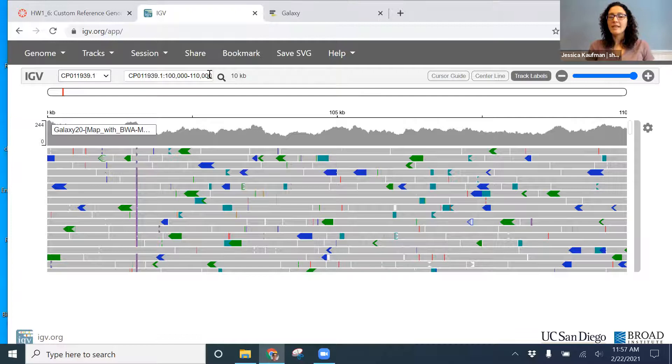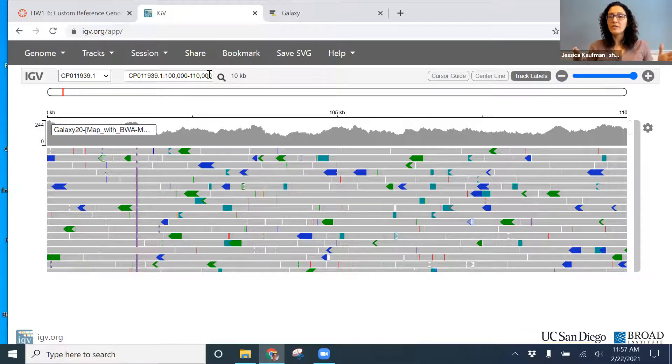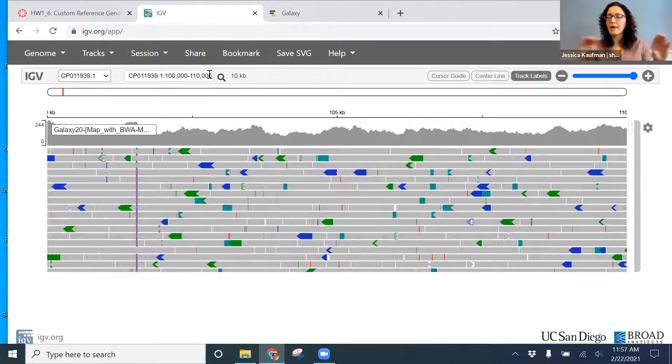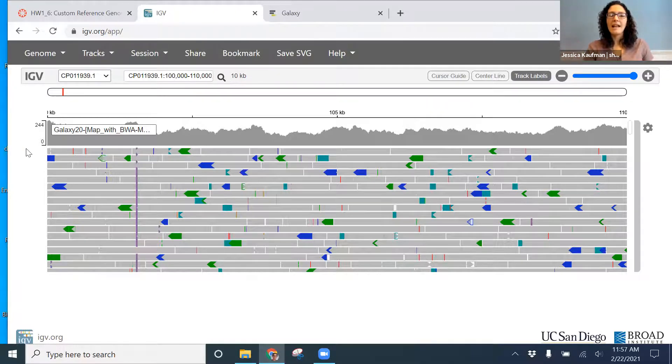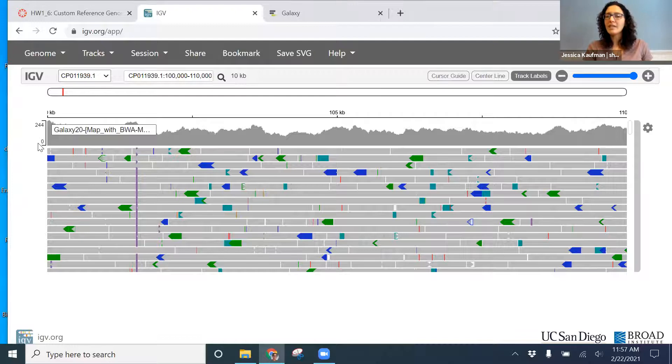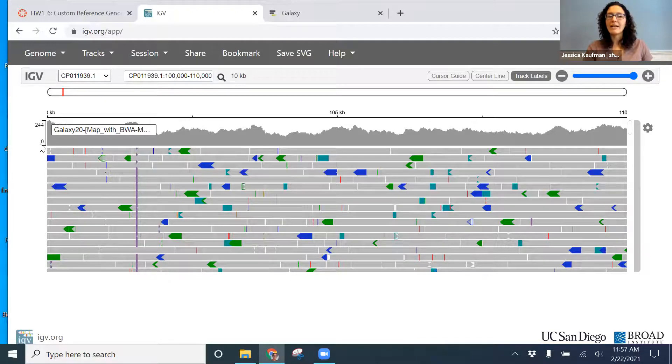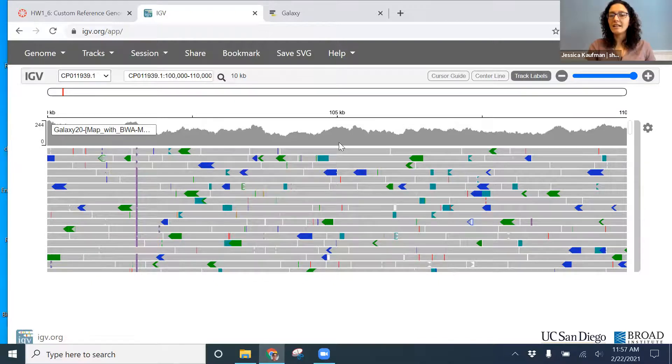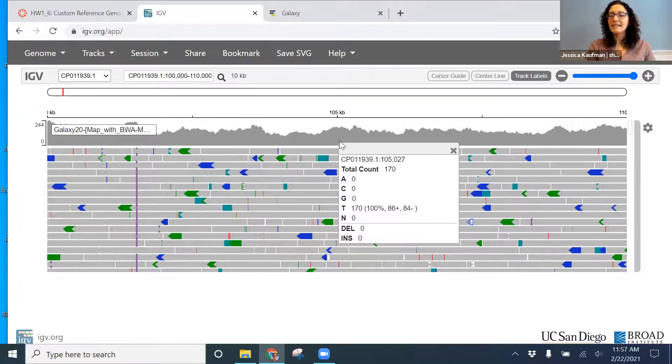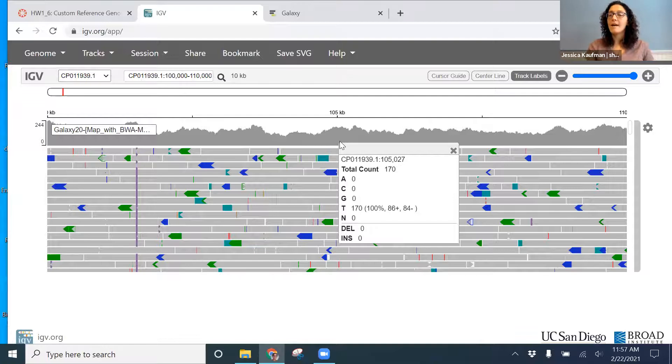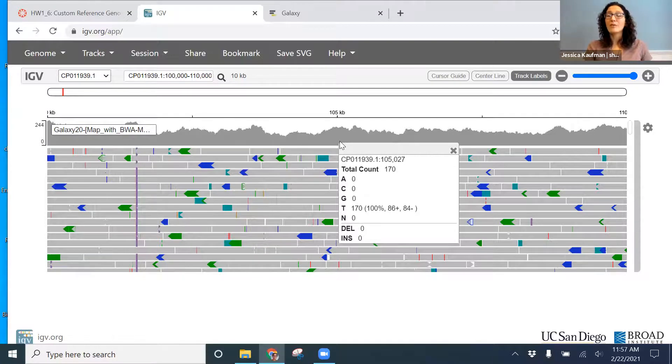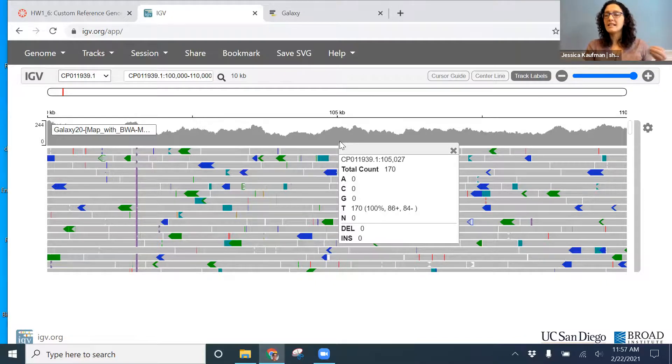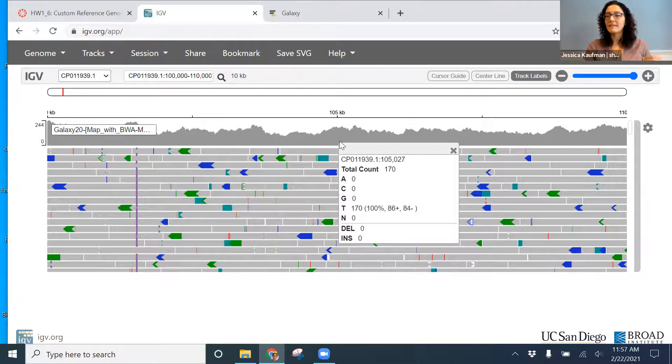So on this portion of the genome, I can see that every base pretty much got read. There's a gray histogram over every base in this region, and the number of times it got read varied anywhere from 0 to 244. I could click on an individual base and see that at this position, the genome was read 170 times. So how many reads align to that base? That's the sequencing depth for that base.